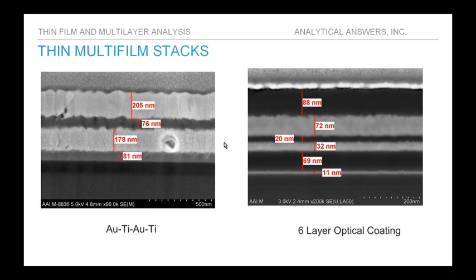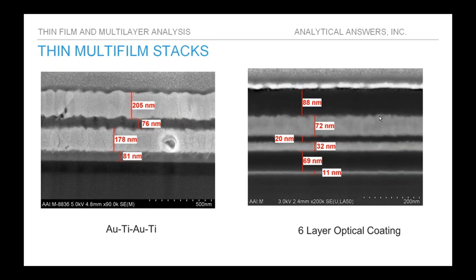A couple of quick examples of SEM images on very thin film stacks: on the left is the same gold-titanium bilayer structure, showing increased resolution and a very clean FIB cross-section with very little smearing of the soft gold layer. You can see some of the grain structure within the gold as well as some embedded voids — difficult to do with conventional polished cross-sectioning. On the right is a six-layer optical coating with a variety of materials and layer thicknesses; the SEM is able to resolve all of them with a very clean cross-section.